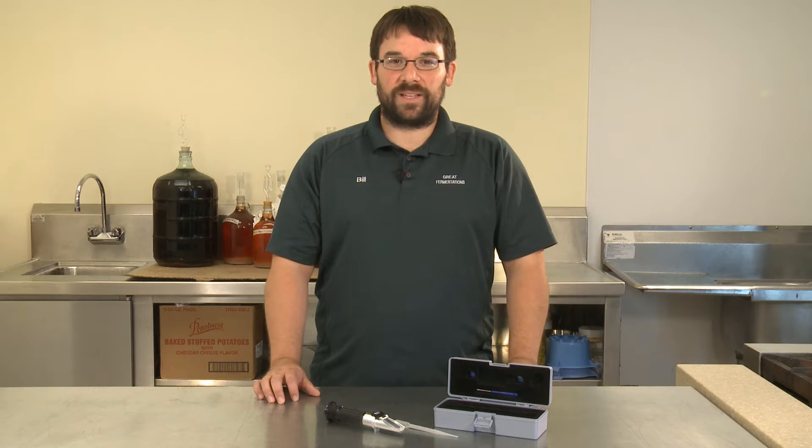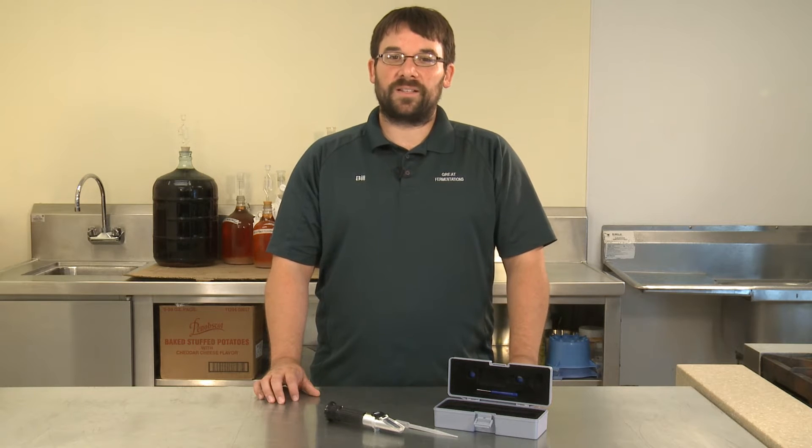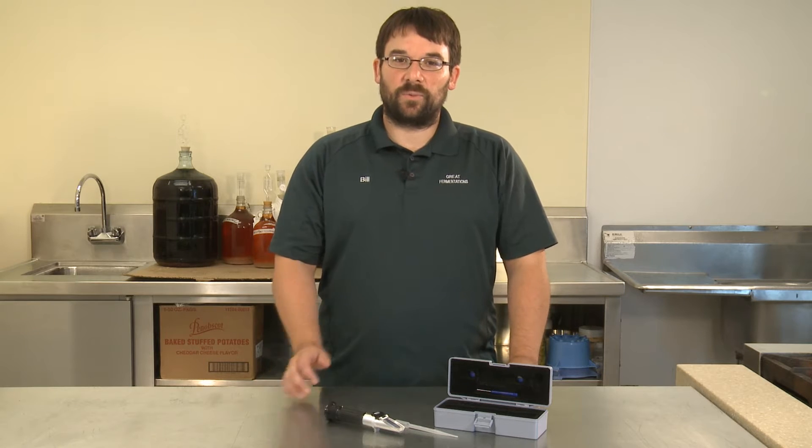Hi, I'm Bill from Great Fermentations. We're all looking for ways to make our processes more efficient, and one of the ways you can do that is with a refractometer.